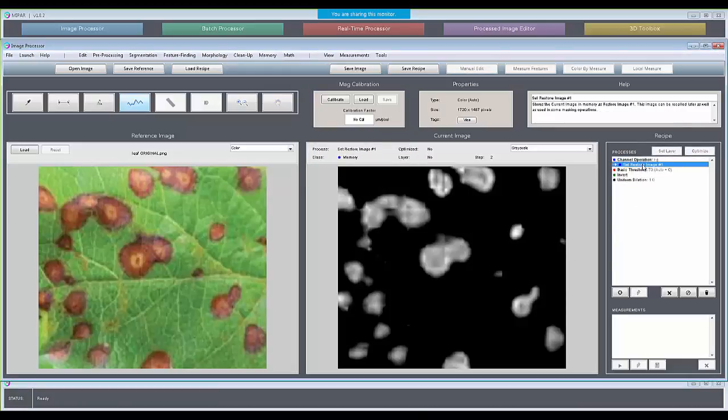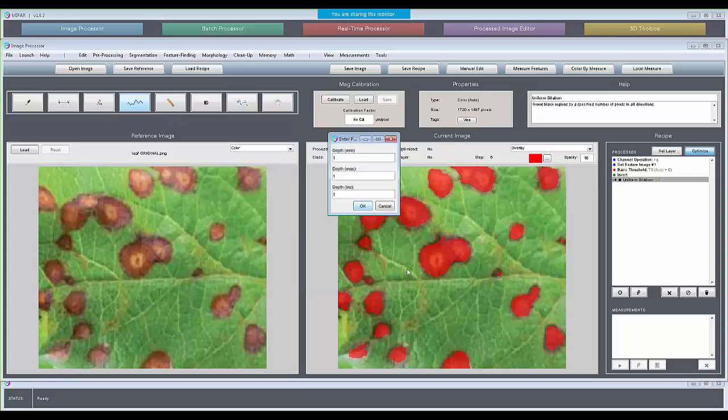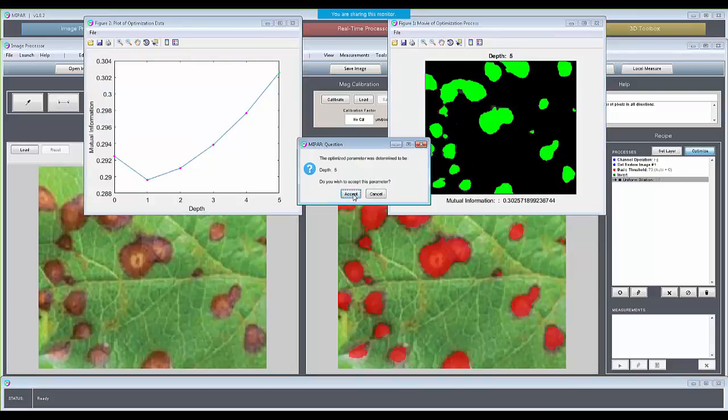So now this is restore image 1. So when I go down here and I optimize my dilation using the entire image, I can say compare it against restore image 1, let the dilation go from 0 to 5. And actually, it wants to keep growing.